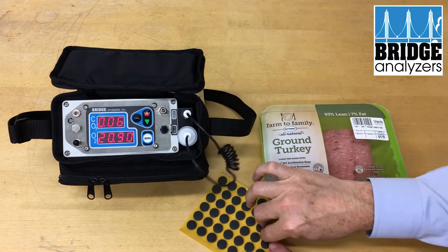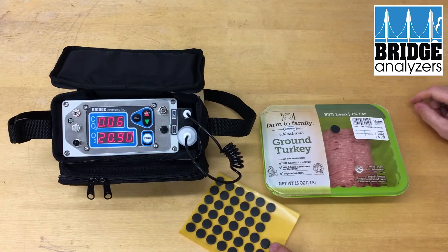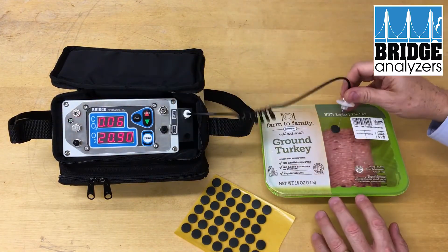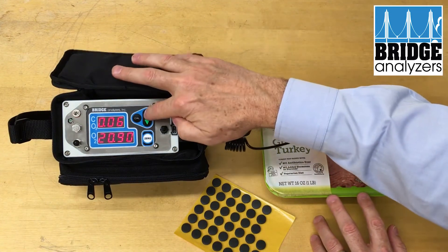We're going to prepare by applying a septum to the package. I will take the needle, put it into the package, and press the test button.